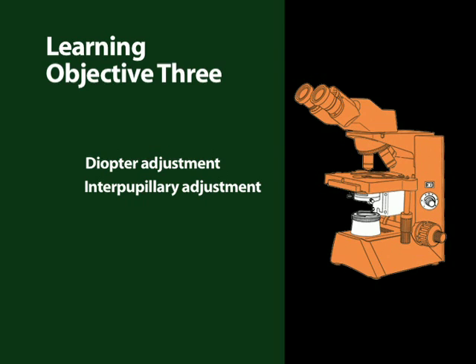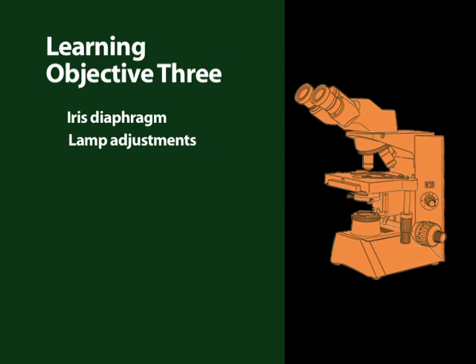diopter adjustment, interpupillary adjustment, condenser, iris diaphragm, and lamp adjustments.